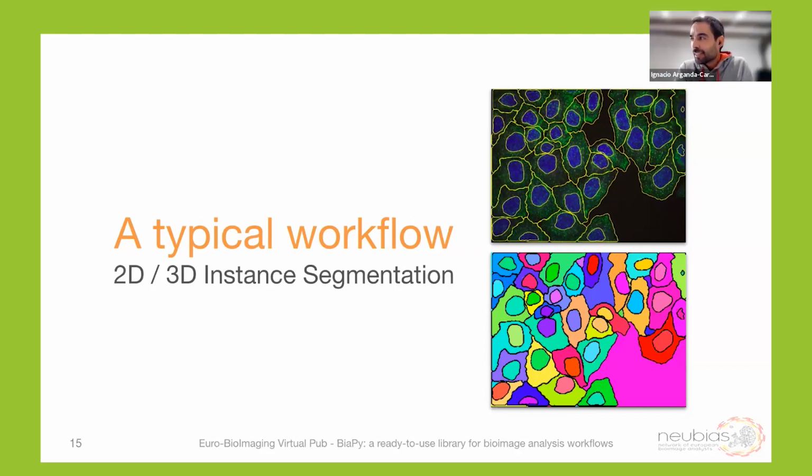Exactly. So this is something that we have just done. You go to GitHub, one of the latest commits, because we had this collaboration to do detection on full brain images. And of course, we needed something like this. So yes, we are importing Zarr files and then loading just pieces of them through H5. But yeah, we are there now. Yes. All right, that's great. I will play with it. Perfect. Thank you. Okay. All right, thank you. Yeah, I guess you can continue. There are no more questions I see in the chat. Perfect. So thank you very much.